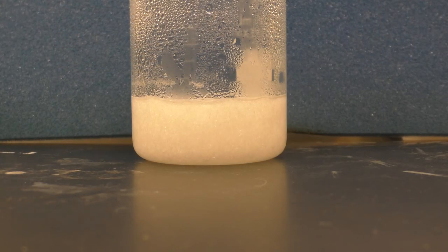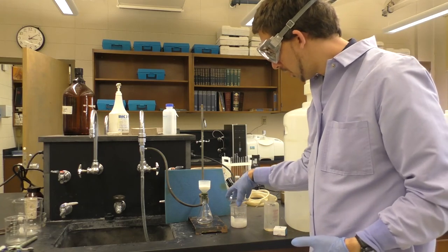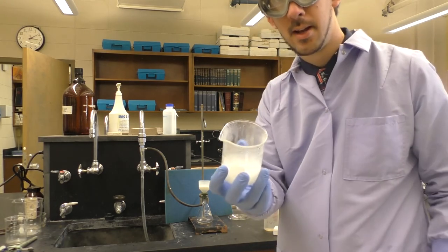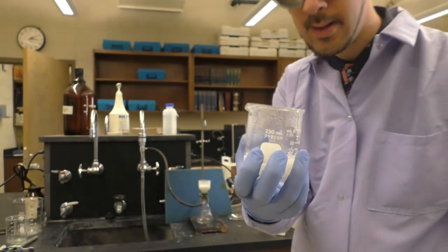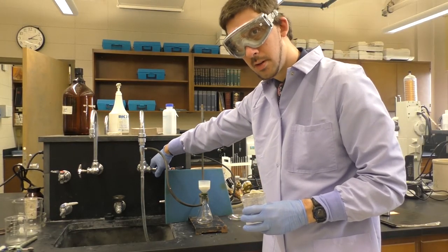Now that the solution is cooled, we are ready to collect the crystallized material by filtration. So we'll go ahead and collect those crystals by filtration. You can see if I remove the wash glass from the top and look carefully inside, we have some really nice crystalline material in there, some very nice needles. So I'll turn the water aspirator on.